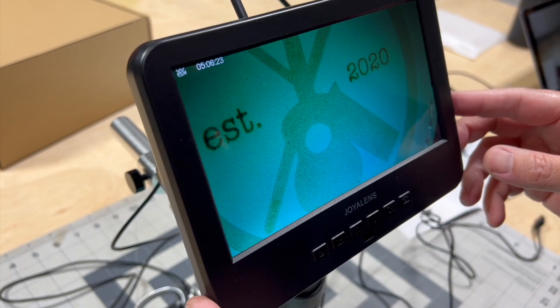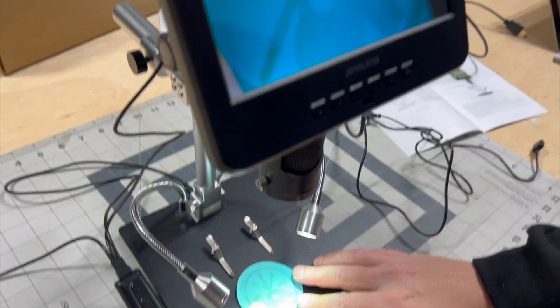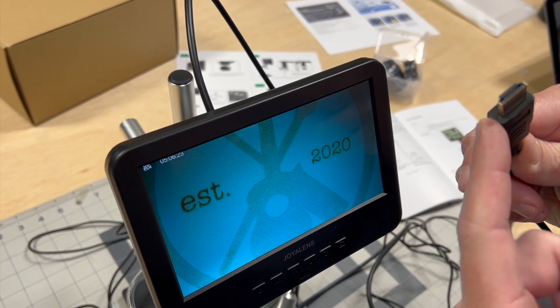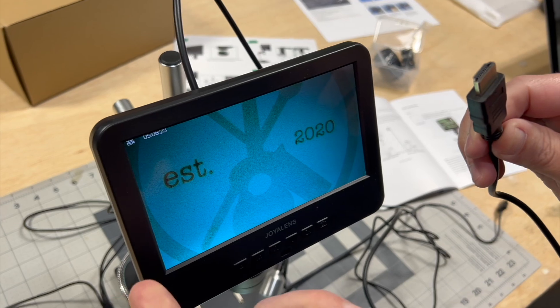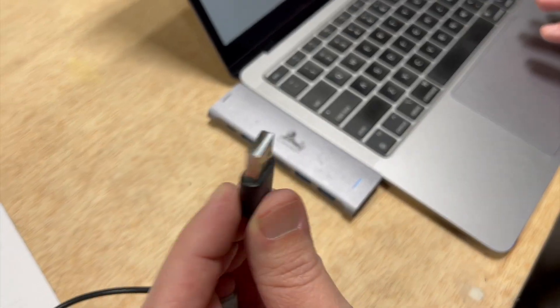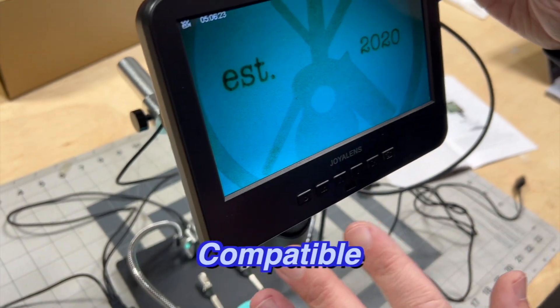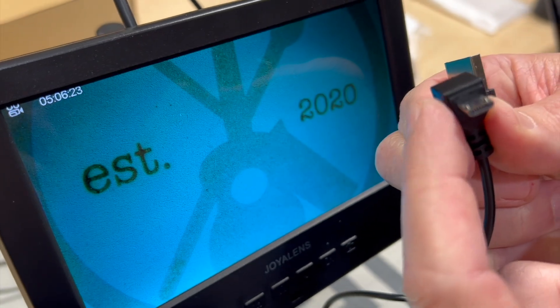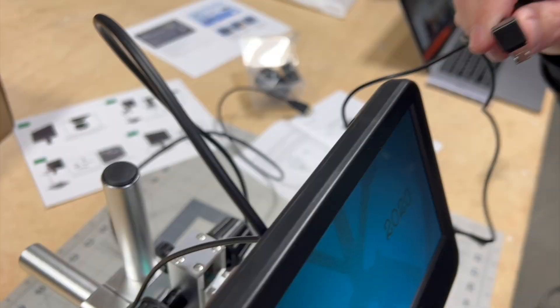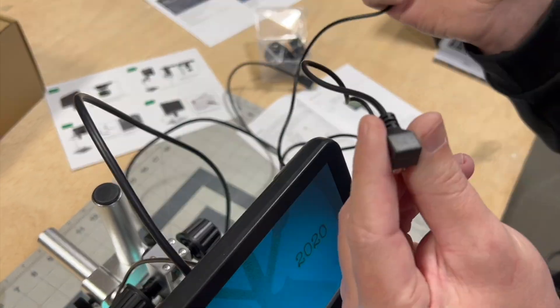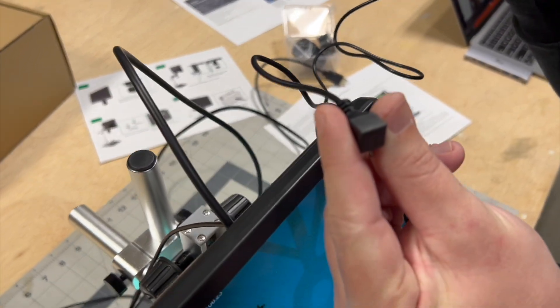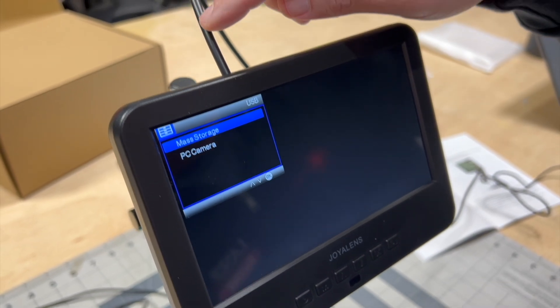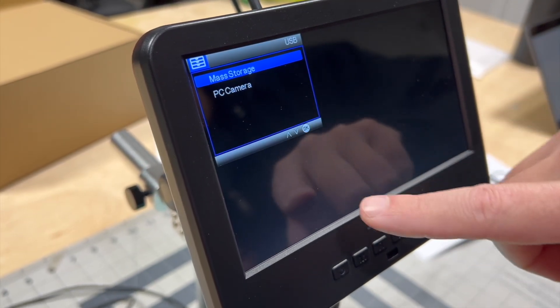Okay, so now we're going to get this connected to our computer so we can do some cool screen recordings of us messing around with this stuff. Now important to note, this HDMI cable is not going to work for us because for Macs at least, the HDMI cable port on our dongle is for export only, so we won't be able to bring in video. So we'll have to bring it in via USB and see if we can do that with a Mac because this says it is compatible with Windows machines, but we're going to see if we can get this to work with our Mac.